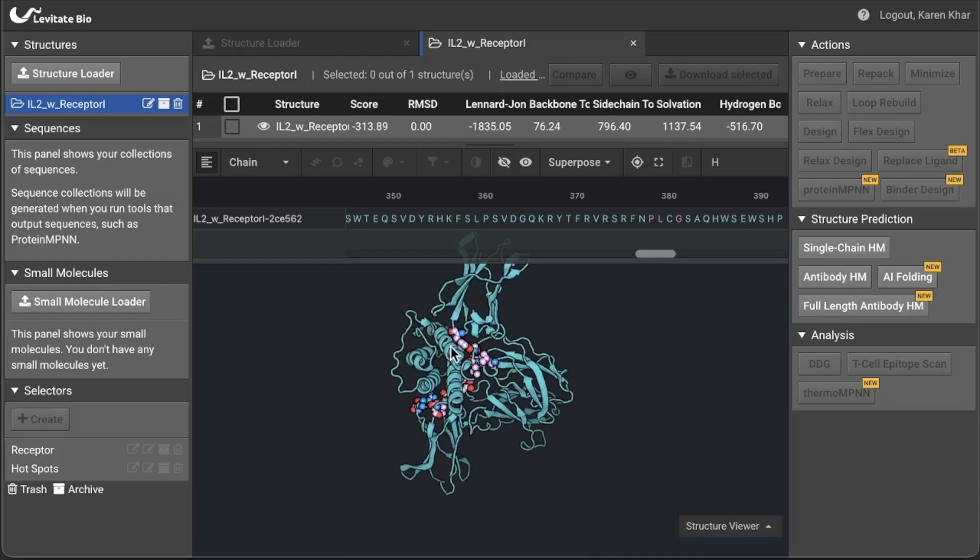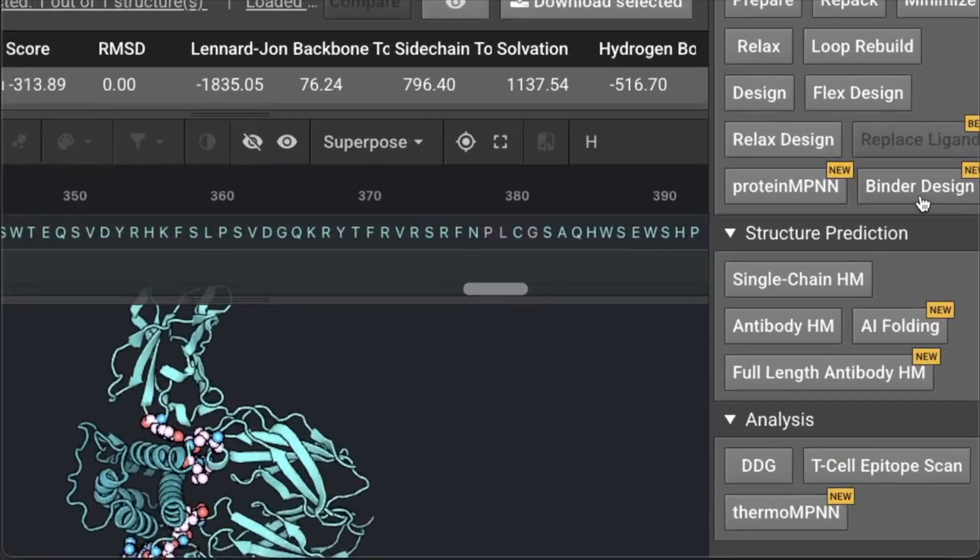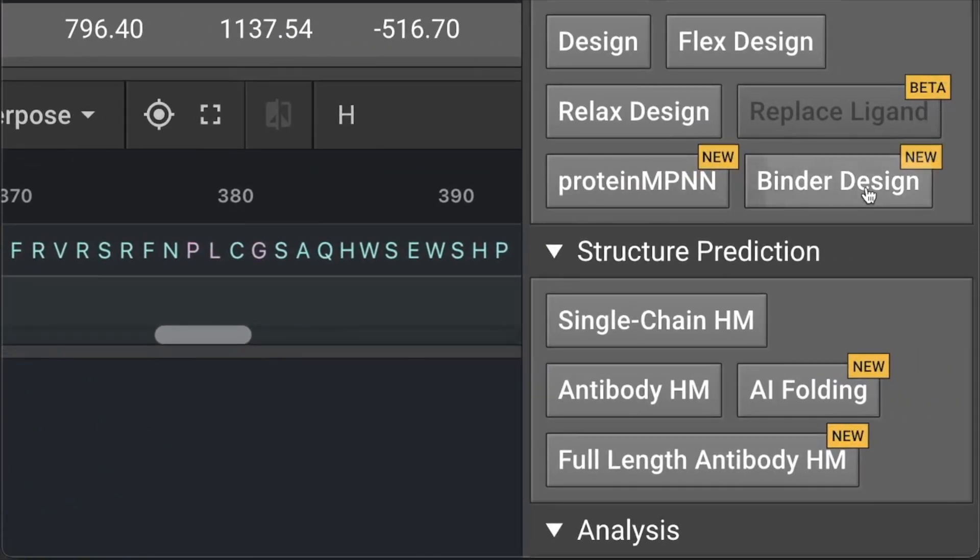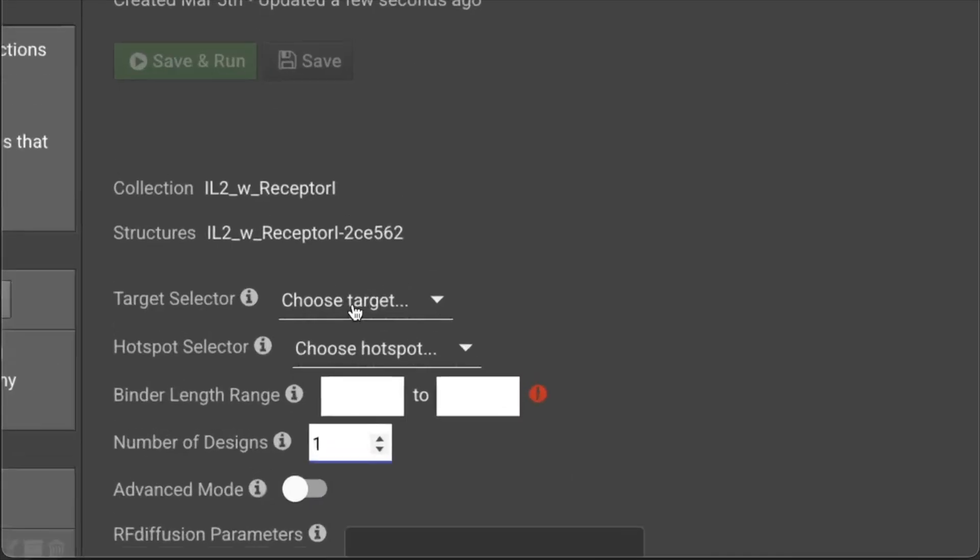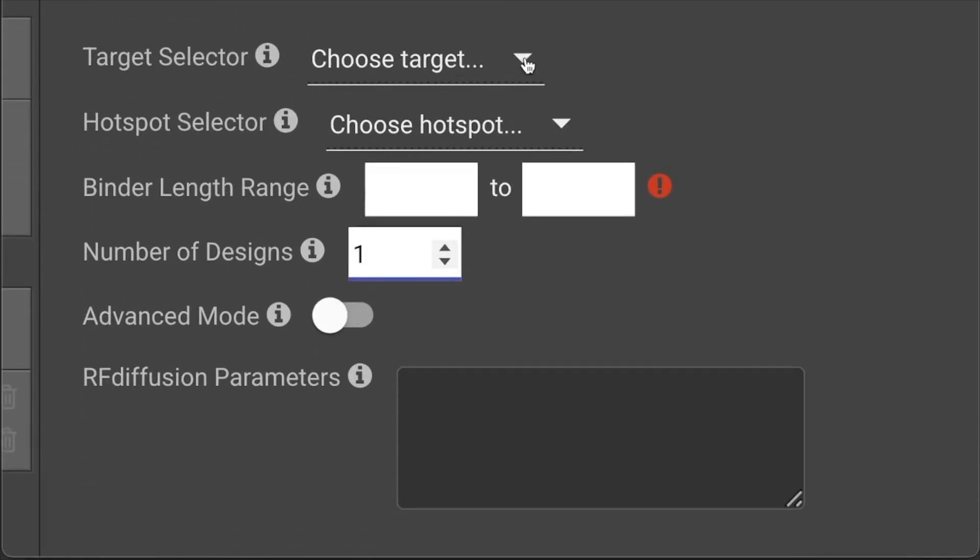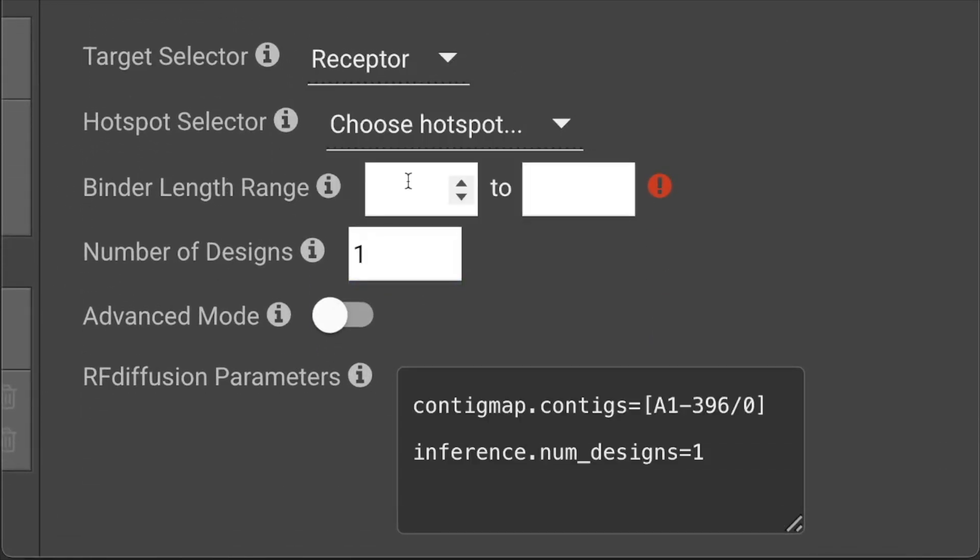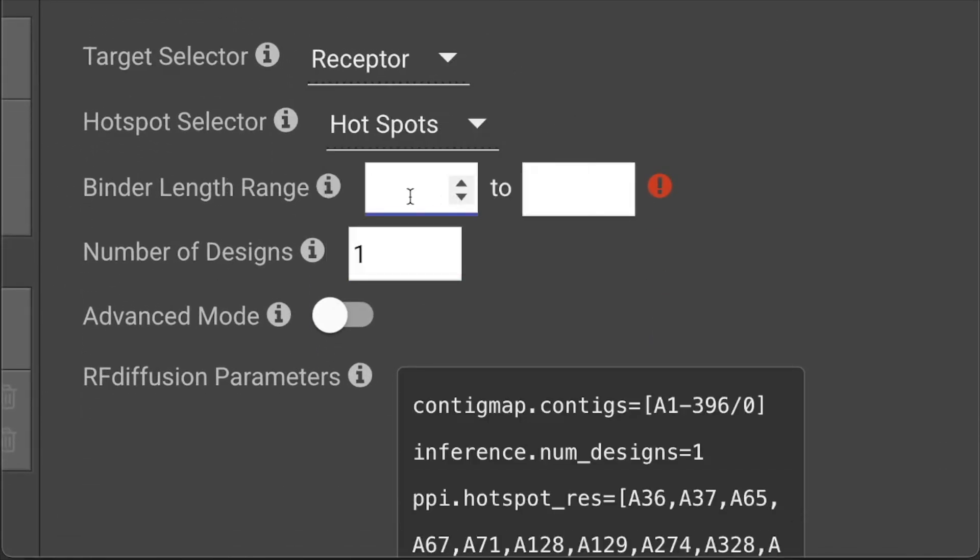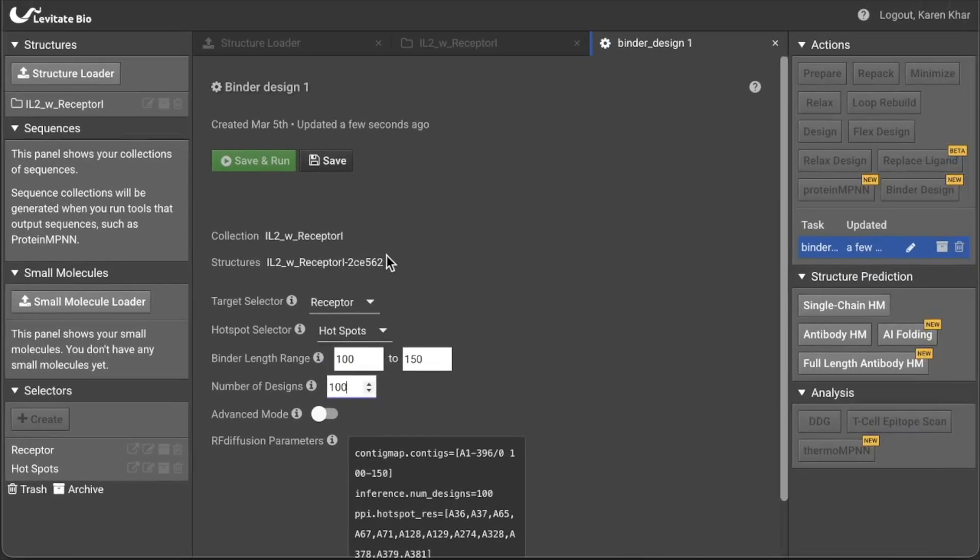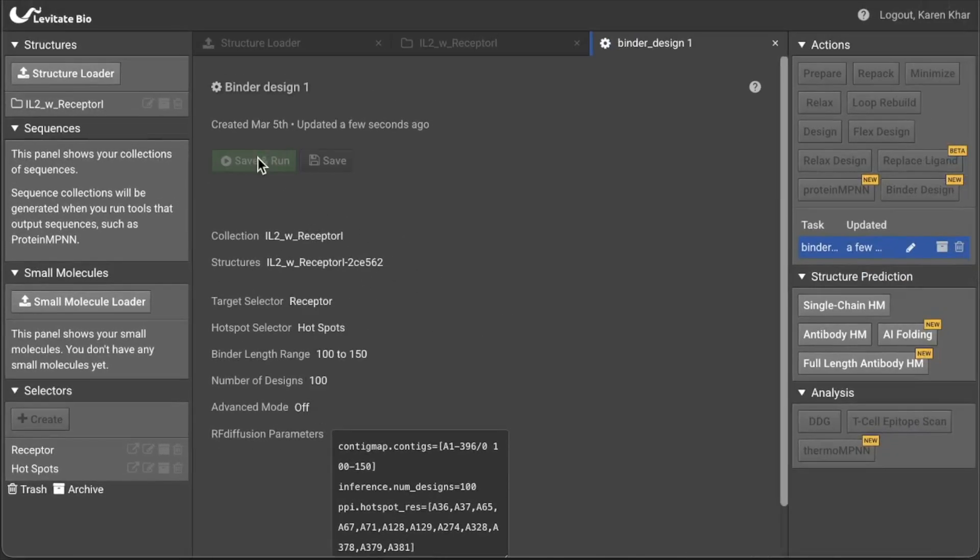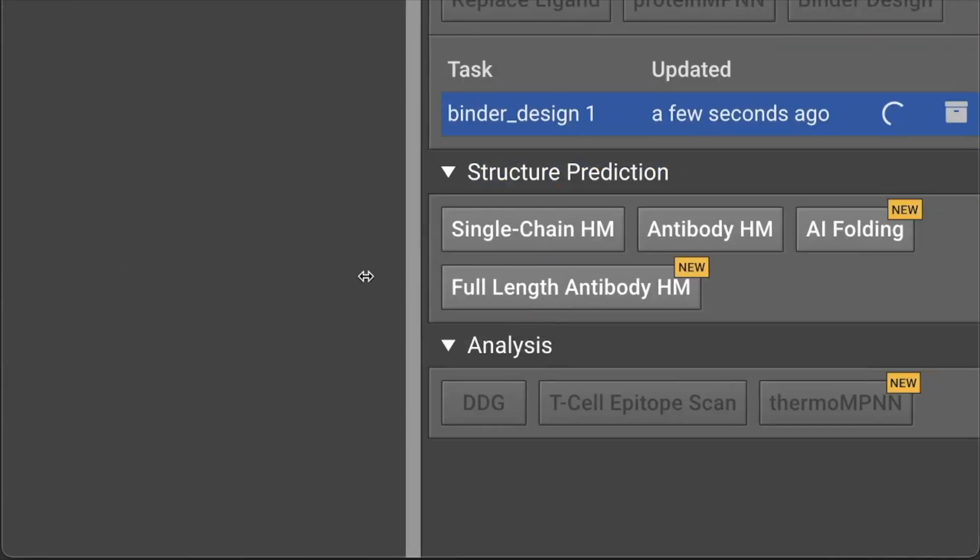Now just click the binder design button to open a tab. Enter the target selector and the hotspot selector and define how long the binder should be. And tell it how many designs to make. Then click run. This submits the job to the cloud and you can return later in the day to check the results.